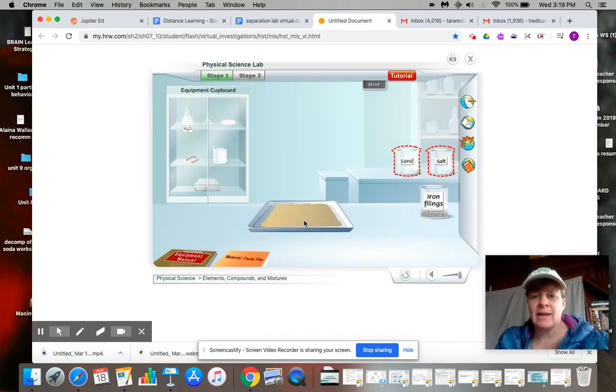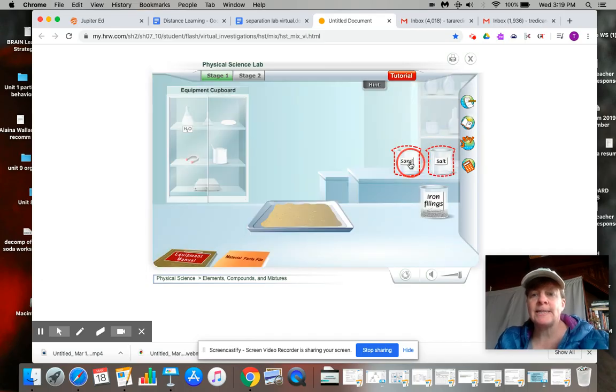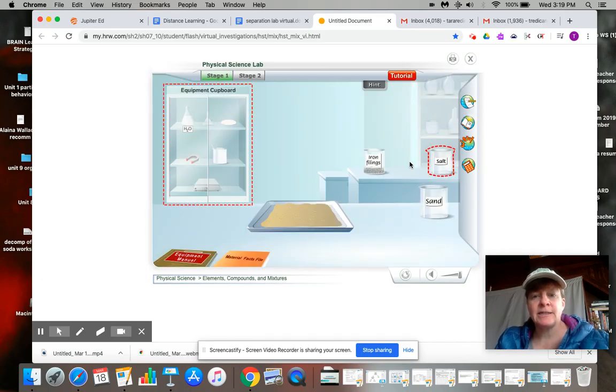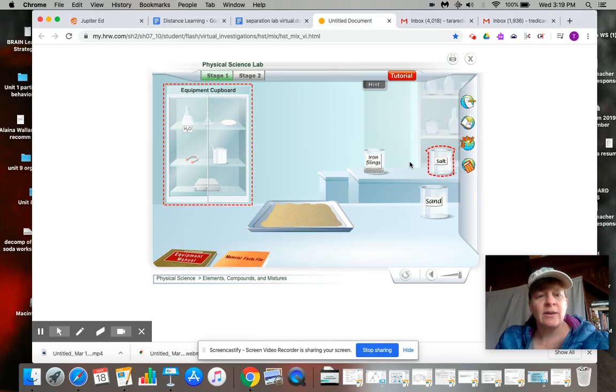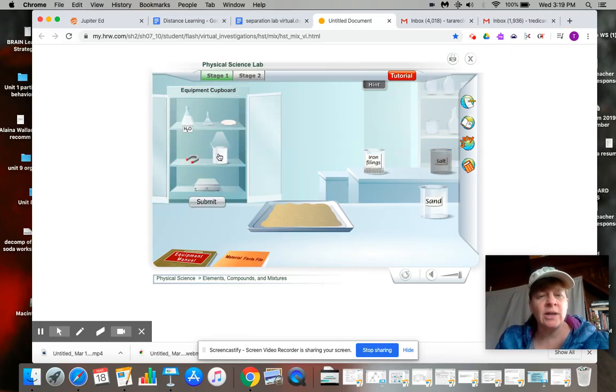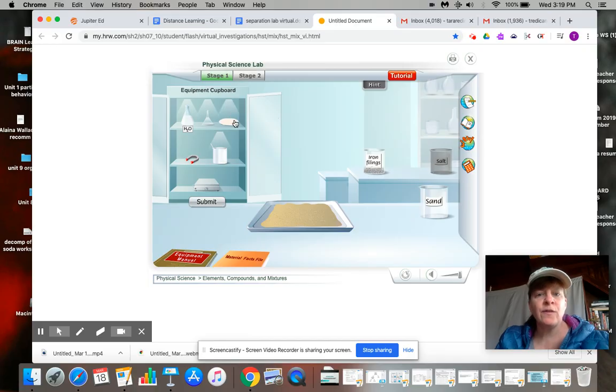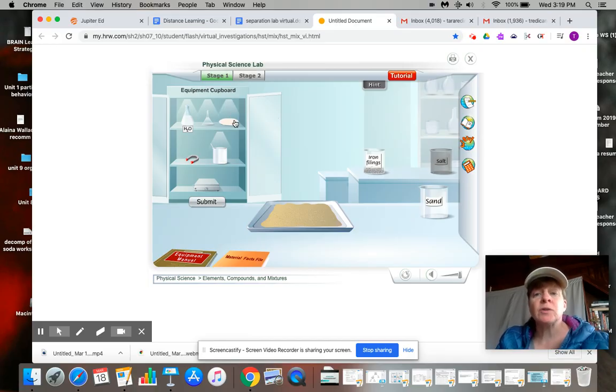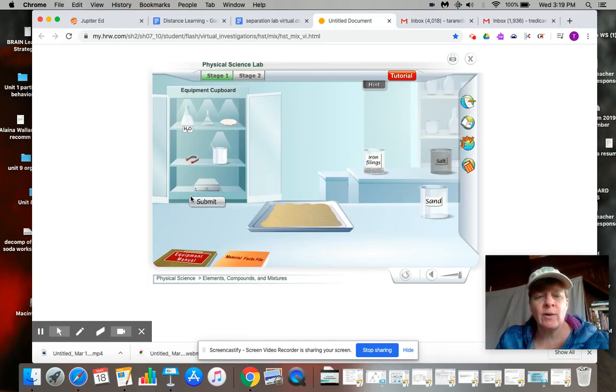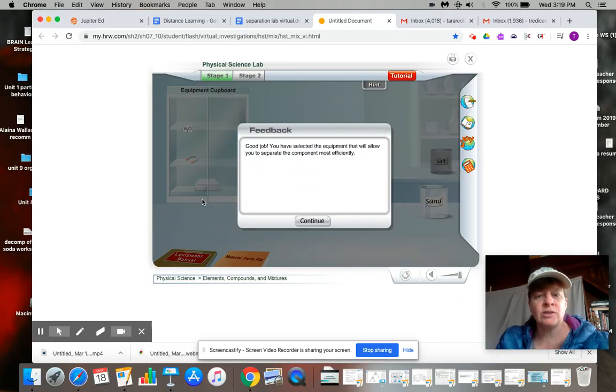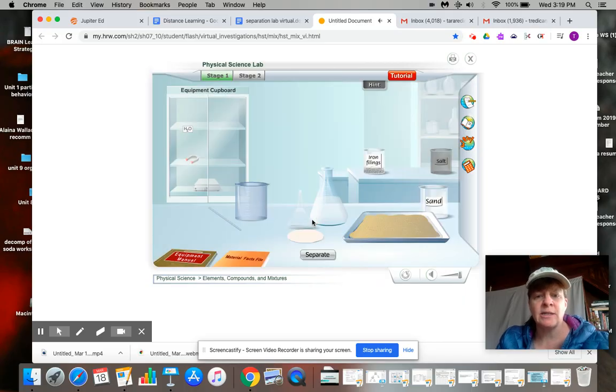Okay, next we're going to work on getting the sand. And for that we're going to need a beaker, some water, a funnel, and a filter. Because the sand particles are larger, let's go ahead and start that separation technique.